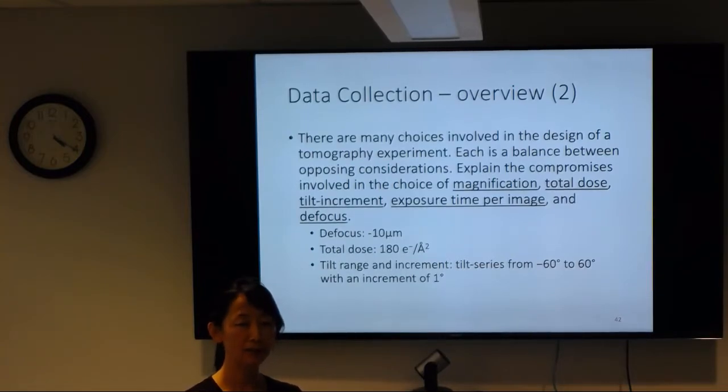And then details. For example, if you want to do dose fractions, you just want to do counting. You want to set up your dose rate and your defocus. There are many parameters you need to set up. For example, magnification, which is a very simple one. So how do you set up your mag? It depends on the pixel size you want, how much detail you want to see.